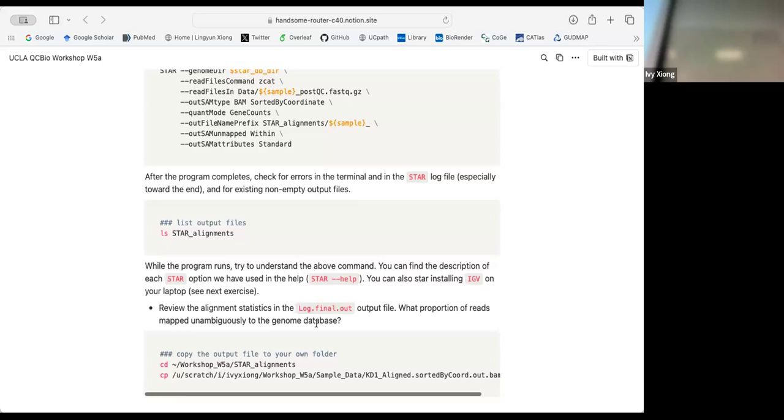I thought I didn't have it. Did you make it again? You said you have to run it. You didn't run it yesterday. I have the raw file, right? That's where you copy it from. Okay, this is the raw file. Or you can just gzip. Yeah, gzip.